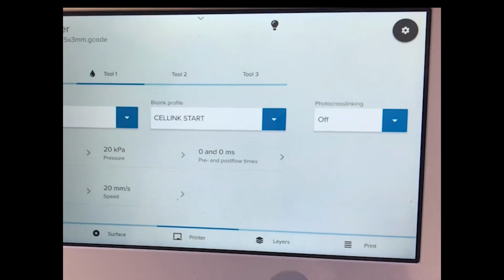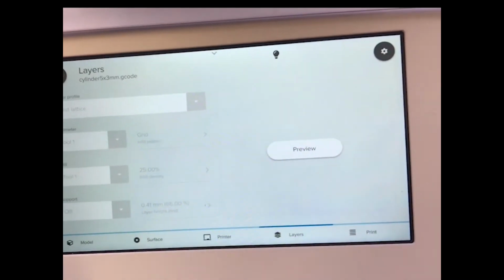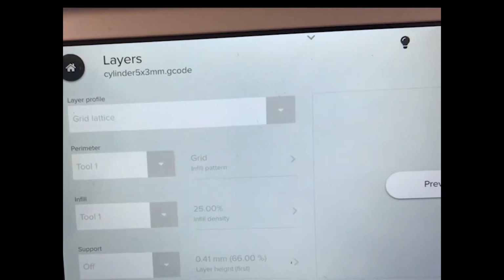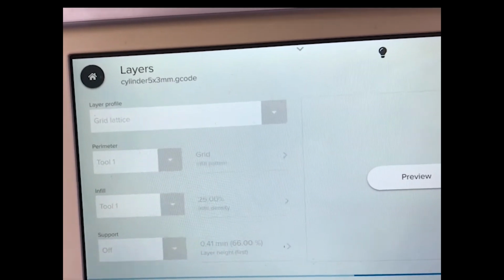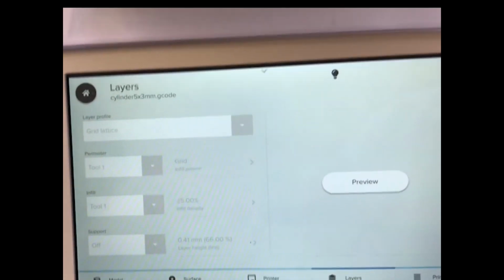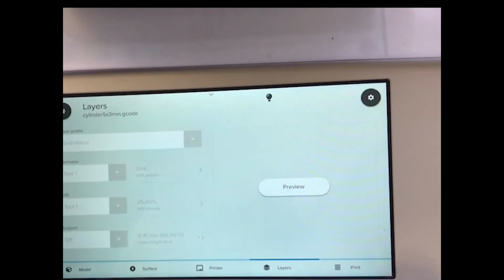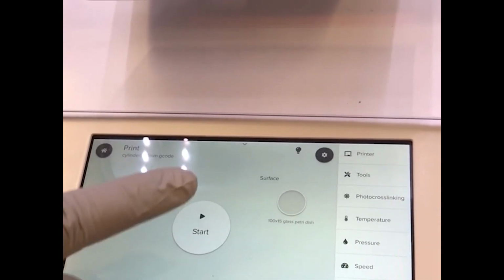So moving on, this is a step where you can control how you want to set your infill and the different layers. Since this is a pretty basic print job, it's not going to give you the options because you don't need to be that specific, but you can choose the pattern of infill and what percentage of infill you want, as well as the support material along the way. That can all be controlled from this. And now it gives us the option to actually start printing, and you can see it doing that.